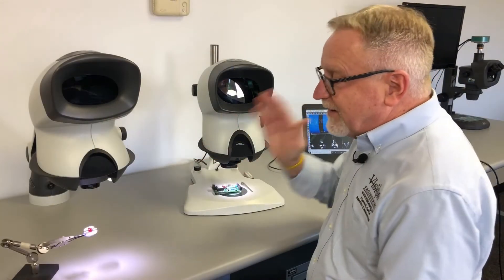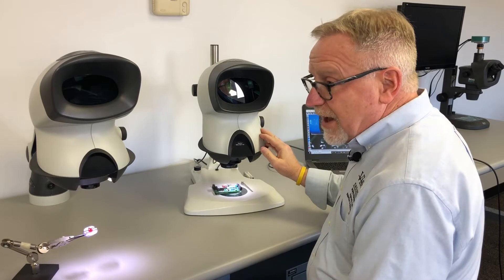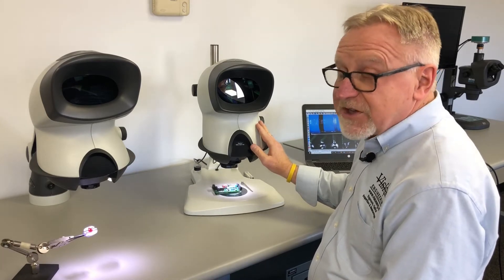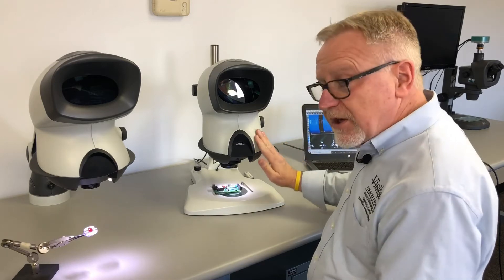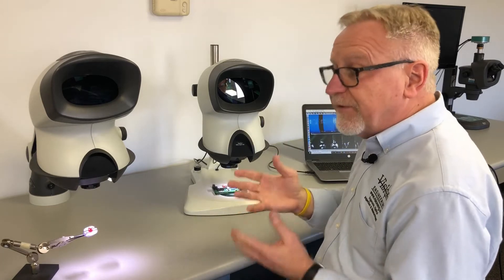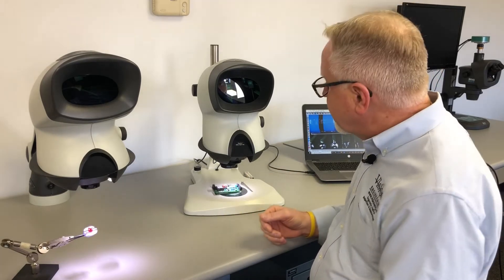The big brother to the Mantis Compact is the Mantis Elite. The Elite is more powerful and has more options available. With an Elite, you can have a magnification range between two and potentially as high as 20x based on applications. The Elite is capable of holding two lenses at a time, so you can have a low-power lens for big field of views and large working distance, and a high-power lens for inspection of work that you've done underneath it.